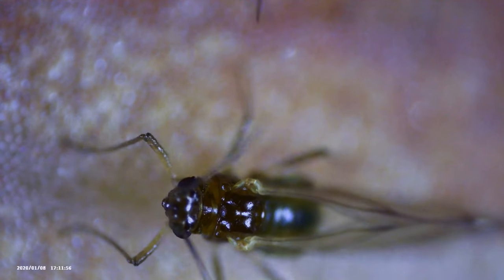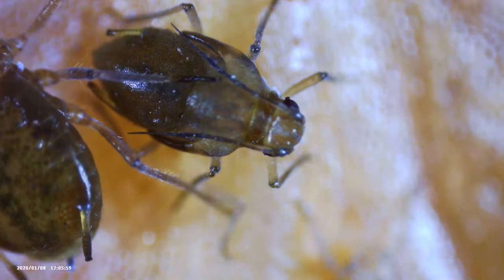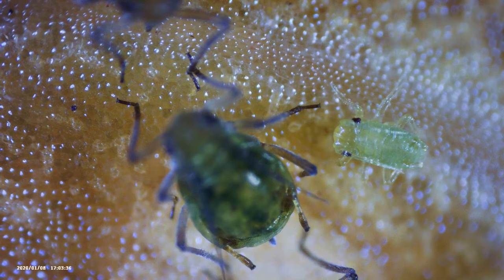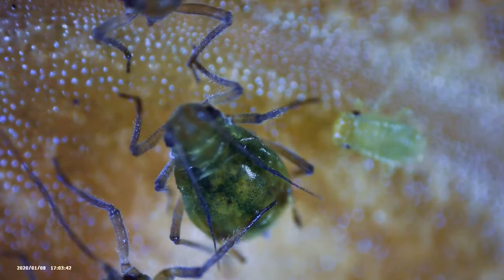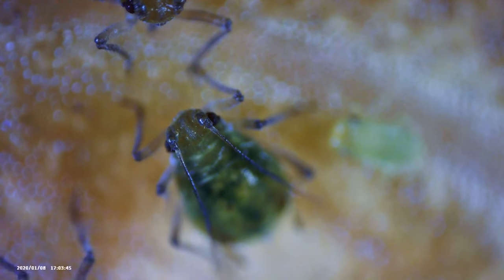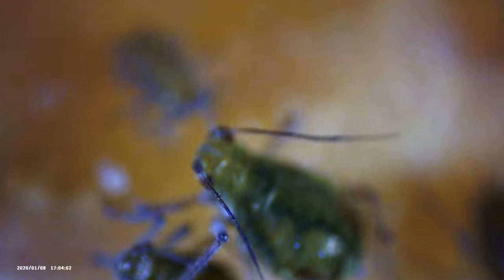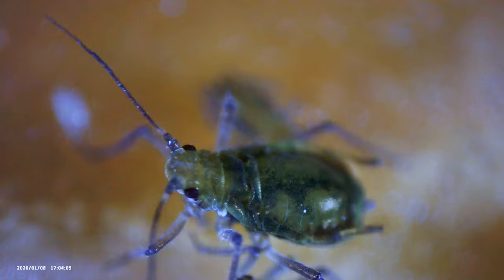When looking at some of these adult aphids — well, not adult yet because they don't have their wings — you'll see on the sides they almost have what look like little penguin wings. That's where their wings are developing before they shed their exoskeleton and transform into their final phase. I obviously hate it because that means they can fly to the next plant. I'm still working on good guides for getting rid of these; I've tried a lot of different chemicals and manual work but haven't found the perfect solution yet.